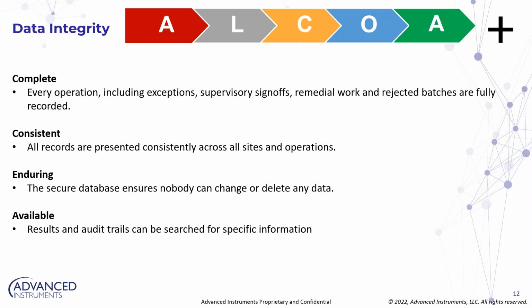Additionally, you're not allowing somebody to go in there and make changes or delete data. If you're making changes, you want to be able to track the changes, but you never really want to delete any data because you never know when that's going to be important, and every data point on a device is critical to giving the full story, the complete story of that device. So enduring is a critical part of data integrity.